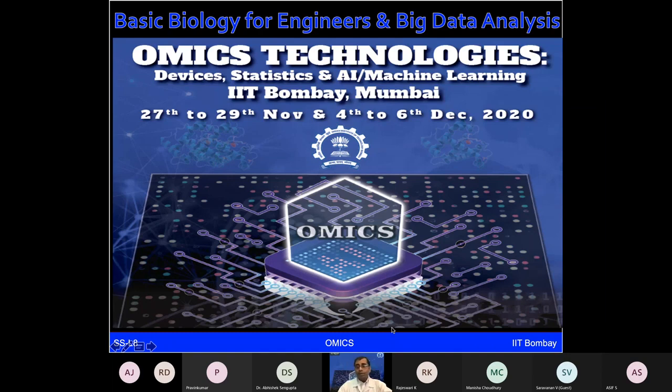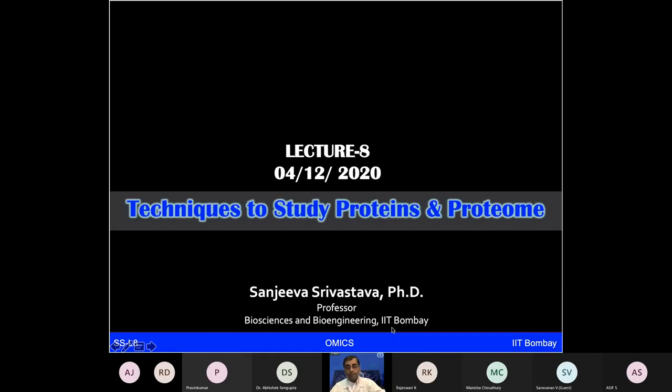In the last session today, we are going to talk about various techniques and different tools involved in doing protein research, and of course, looking at even complex proteome analysis, which is going to start from some very classical techniques, which I'm sure you have used at some level, especially electrophoretic techniques or the chromatographic techniques.